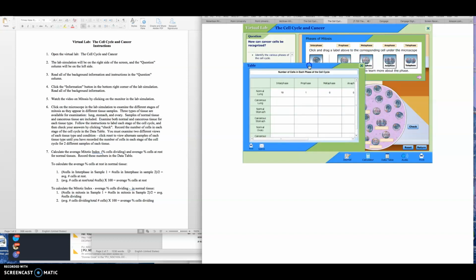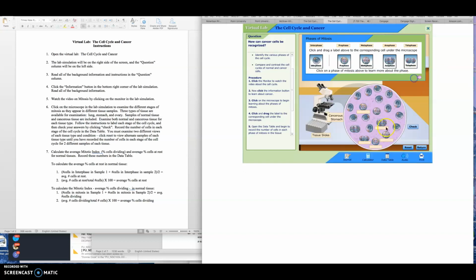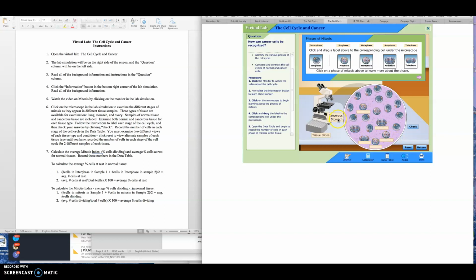All right. Then we, does that save? Yeah. Okay. So now we look at our tissue slides, and let's go to cancerous lung.